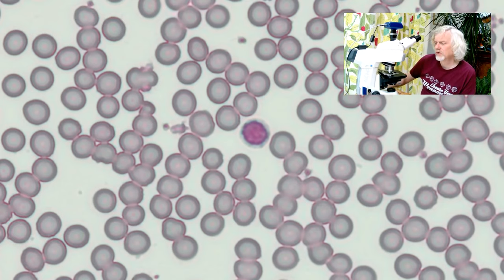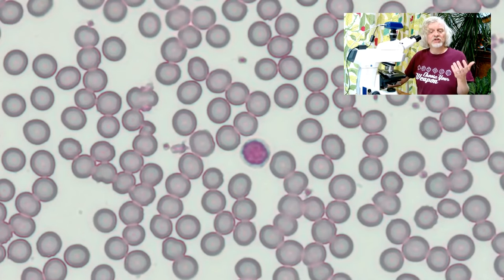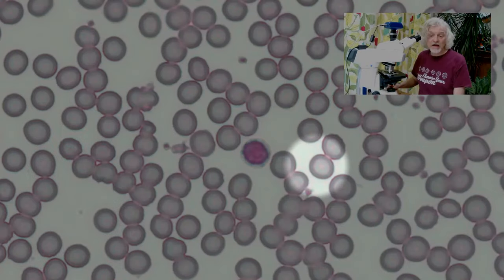my mouse has not stopped working. If you were to put it, oops, under a microscope. And in fact, when you see CSI versions of stained blood, this is normally what they look like, because this is a very common blood stain. There's all sorts of versions of staining blood, and they basically all do the same thing. And they colour the blood cells that pinky, orangey colour there. So you can see these are the individual blood cells here, and here, and here.